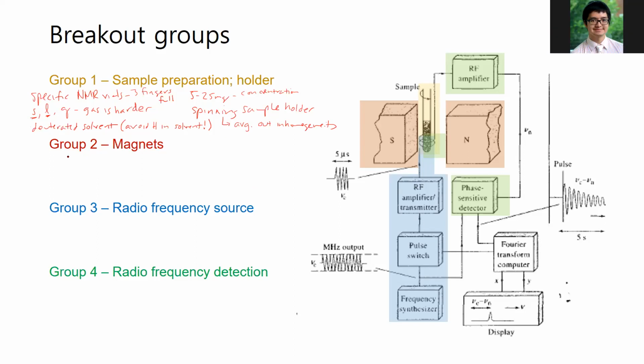Okay, so the magnets, at least what we mostly looked at for a modern NMR system, it's typically a solenoid coil. So just a coil of metal wire, and you run the electric current through, and that's how you get your magnetic field. I guess in terms of the wire itself, it's typically some conducting wire with niobium, titanium, or tin, or usually an alloy of all those elements.